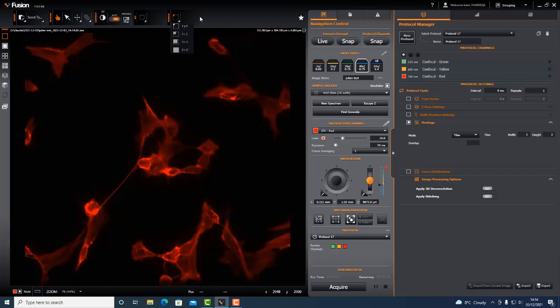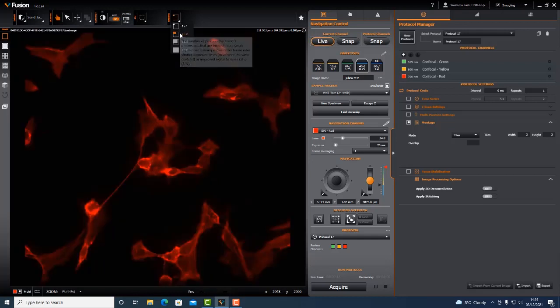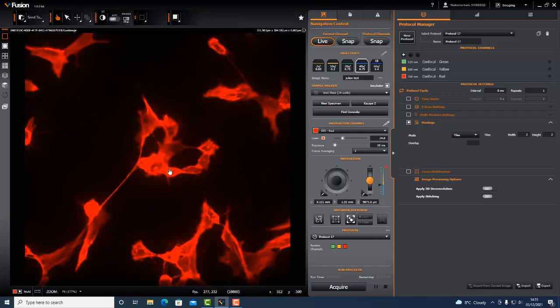So for example, if we go live, you'll see it happen. So if I go 2 by 2, oh sorry, I need to take auto map off, which is not a bad lesson to show you. So this is without any binning, and then I click 2 by 2, and hopefully you saw that it got a little bit brighter. And if I go 4 by 4, you'll see it gets a bit brighter again. So effectively this makes your camera a little bit more sensitive because you're grouping pixels together. It also has the effect, because it's a lower resolution image, that it will speed up your frame rate. So again, you'll get faster frame rates by binning.